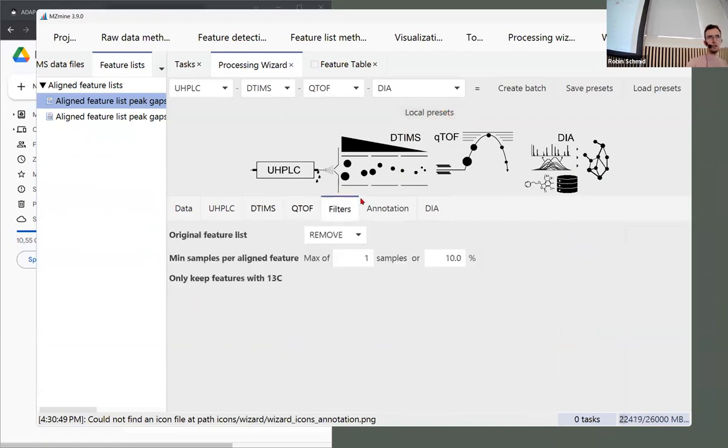As we usually say, the data independent features are new in MZmine. There's software that has been specifically developed for it. But we have something. If you test it out and let us know in the end if you had good experiences or bad experiences with it, that would be great. But you can basically process any vendor's IMS files. Yeah. And if you do, as Robin said, want to process timstof files, then we recommend to use the actual raw data.